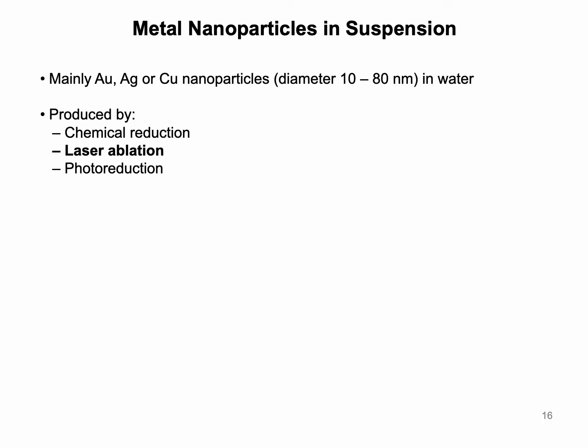As previously mentioned, another approach to increase the LIBS performances is NLIBS. The usage of nanoparticles could be considered a limitation, in fact, as they add to the overall cost of the analysis, and if it is necessary to perform routine analysis, there is the need of relatively large volumes of nanoparticle dispersions to keep up with the demand.